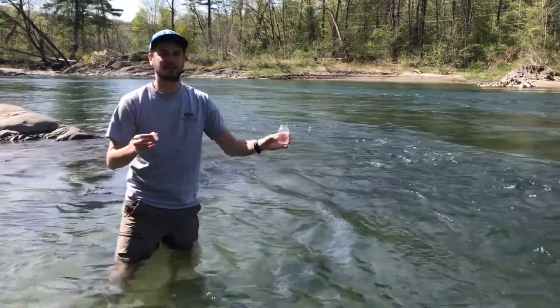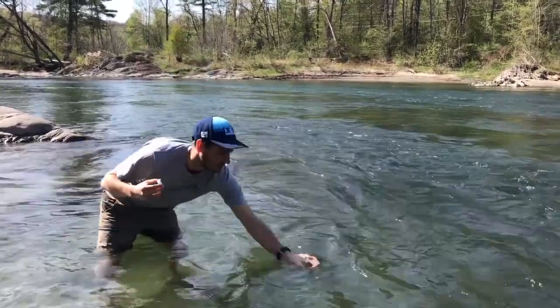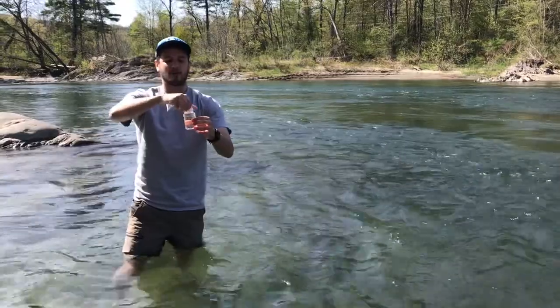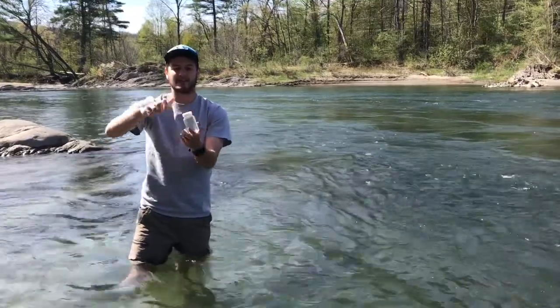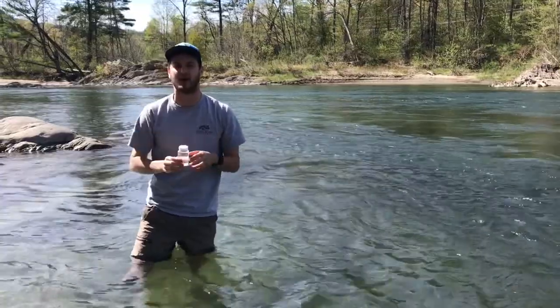Positioned correctly, I'll place the bottle in the water and fill it to the top. You can pour off a little bit of water so it's not overfilled, but you want to make sure the sample goes over the 100 milliliter line. Then seal it tightly, making sure you don't touch the inside of the bottle, and safely exit the water.